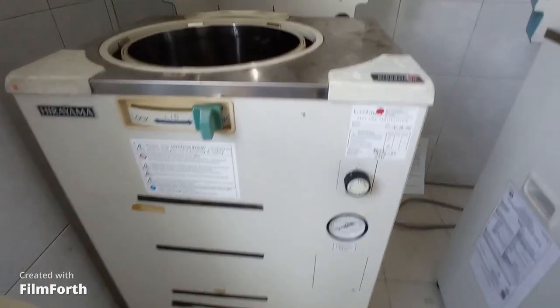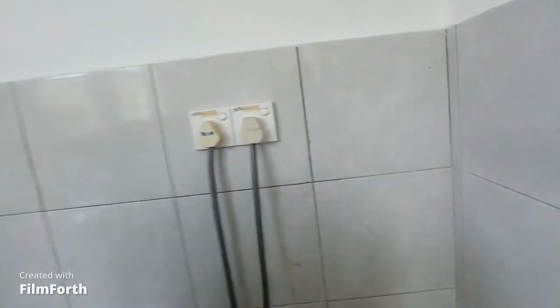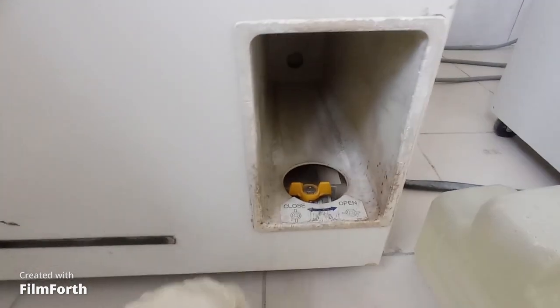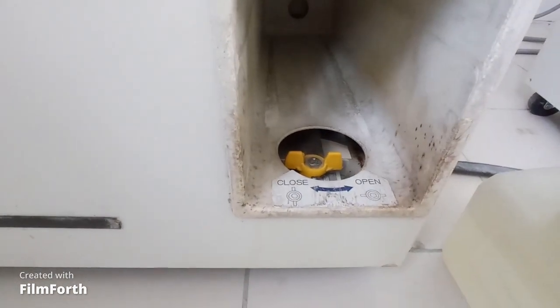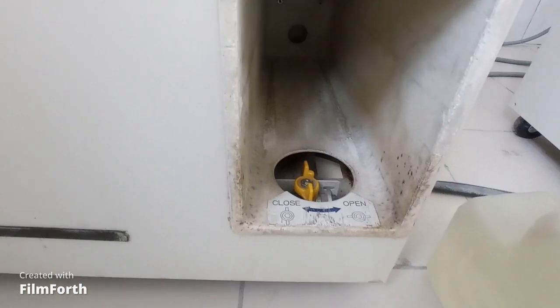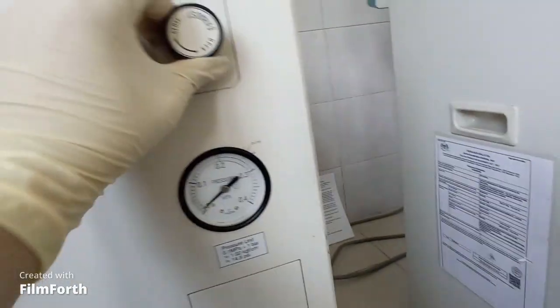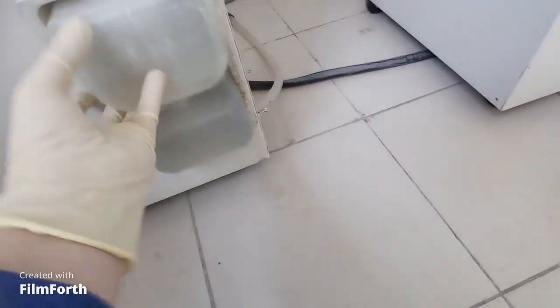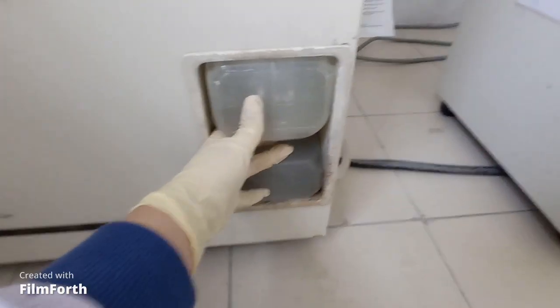I am pouring water into the autoclave machine. I turned on the machine and you have to make sure this yellow plug should be closed, not open — so I am closing it. You also have to make sure this pressure plug should be closed. Now put the water cylinder inside and make sure it stacks properly.